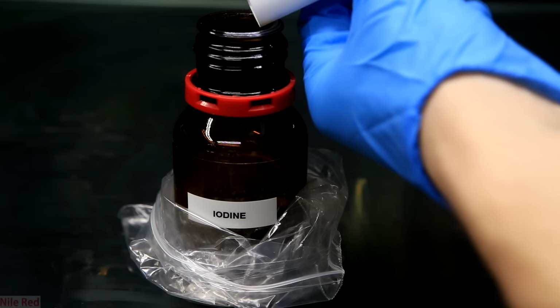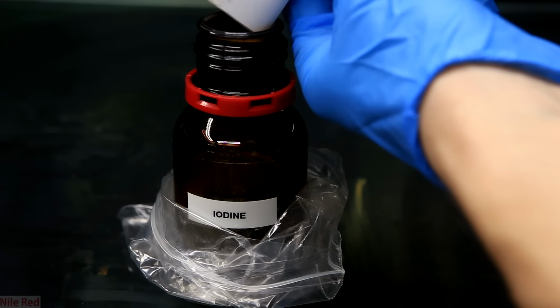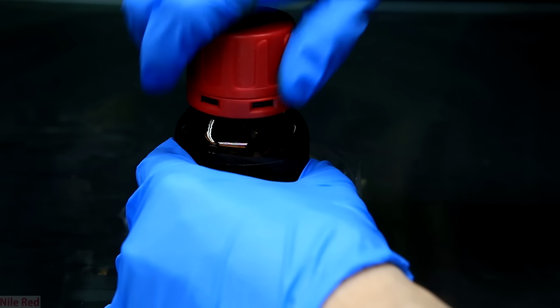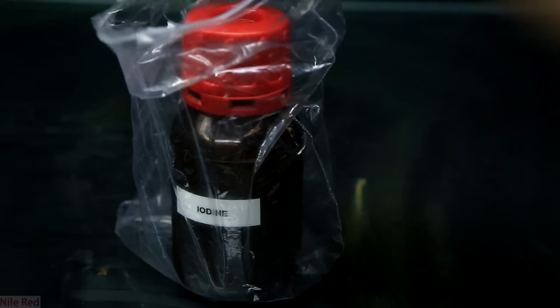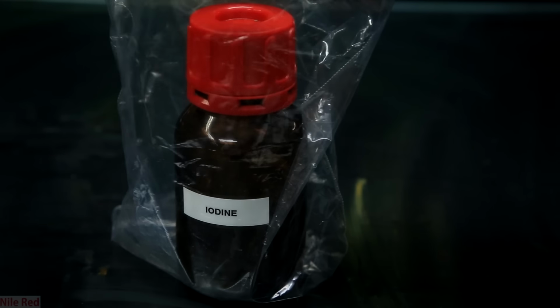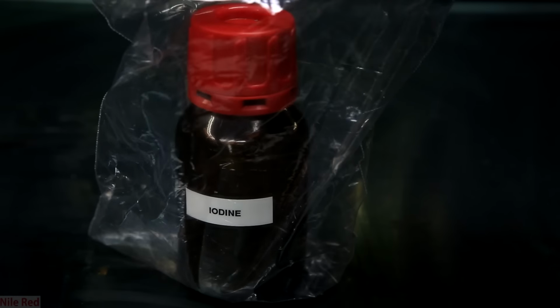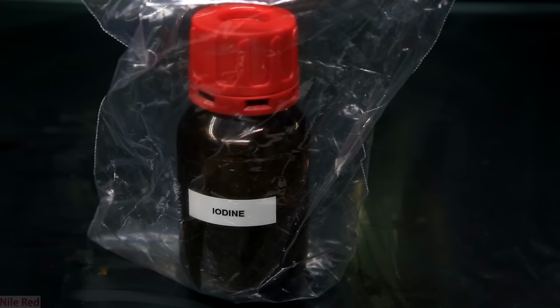I transferred what I got to the bottle which contained all of the other iodine that I already have. At room temperature, iodine does sublimate, and this is why I have a plastic bag around the bottle. It just means that if any iodine vapor escapes the bottle, then it will be trapped in the bag.